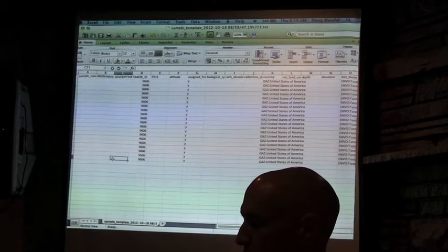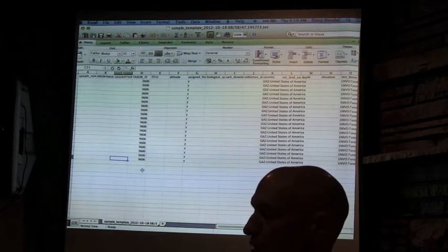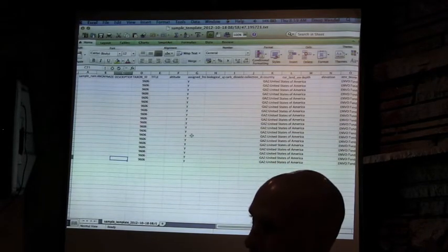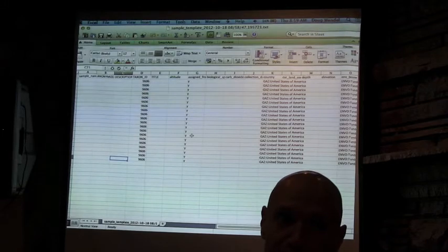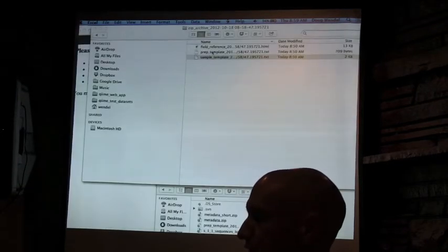you'll see that we have the 20 rows that we said we wanted to generate, and anything that we had pre-filled, it will just pre-fill for you. So we've saved ourselves a little bit of trouble. We could have done more work up front and had very little to do in these templates. So that's nice. That saves you a whole bunch of time.